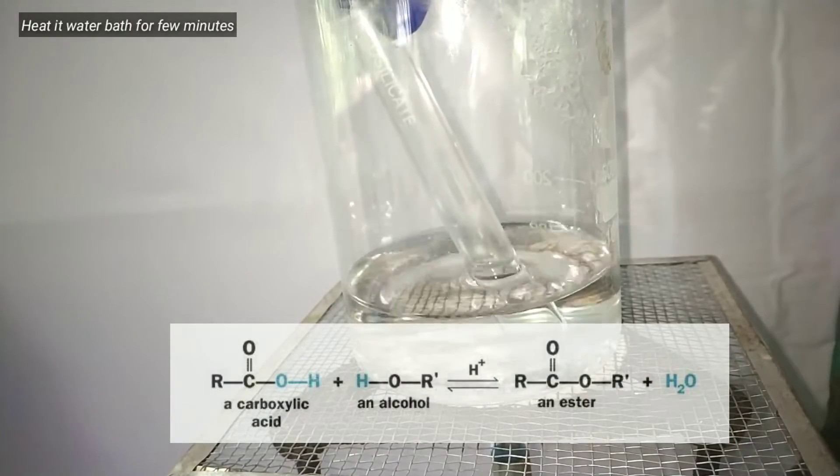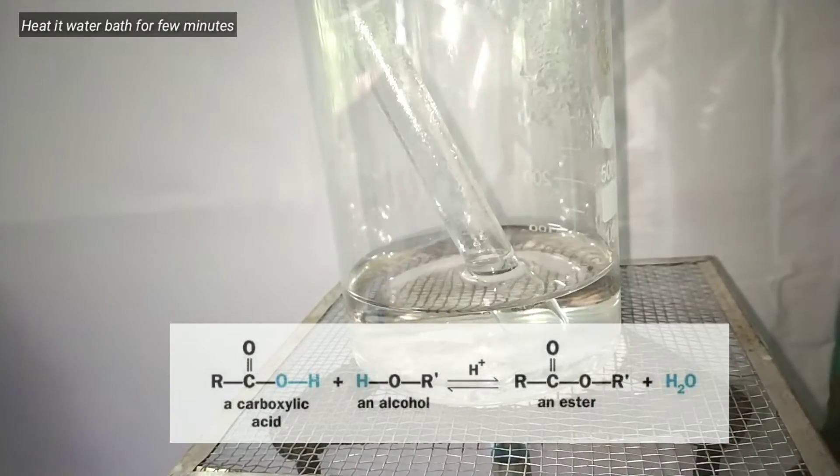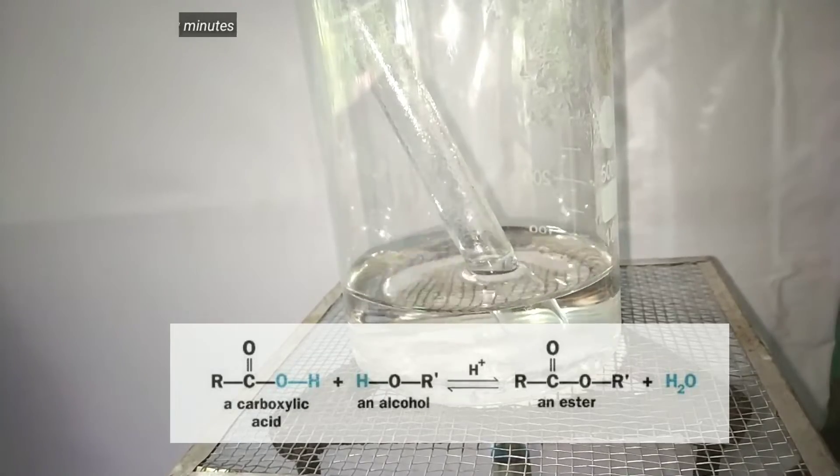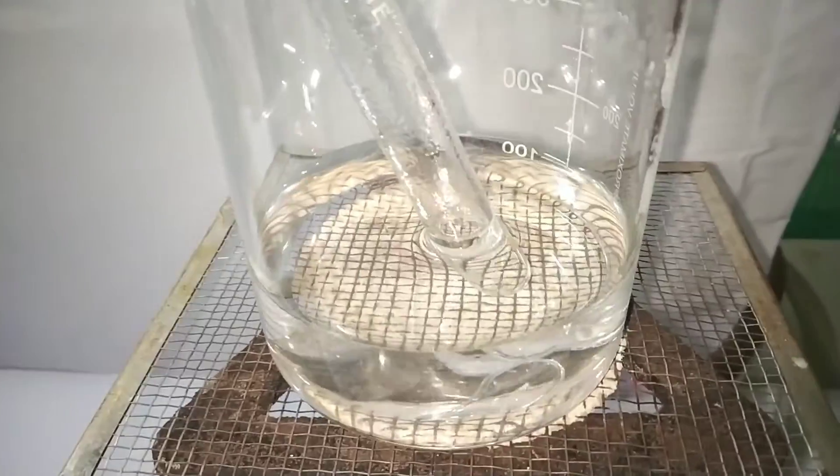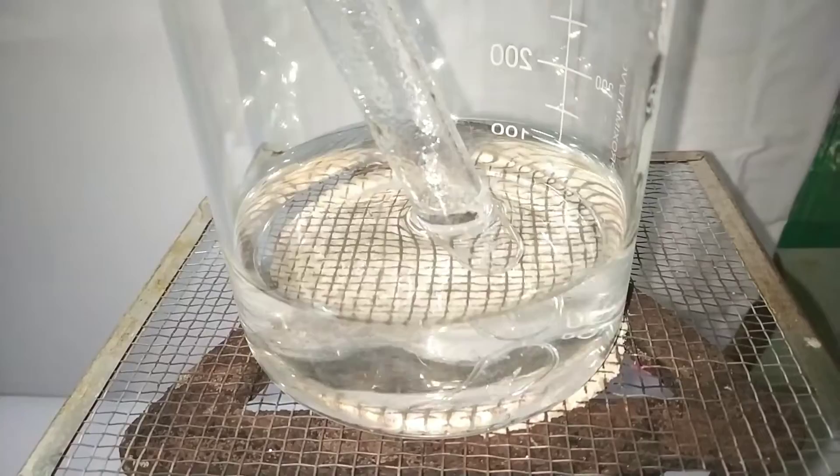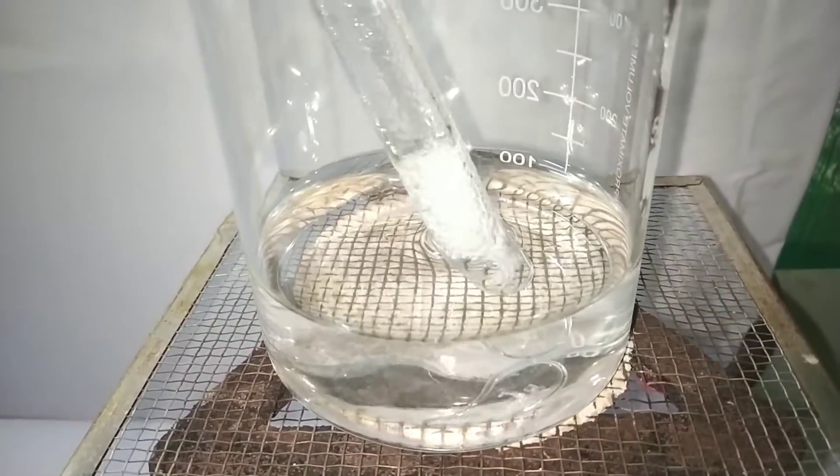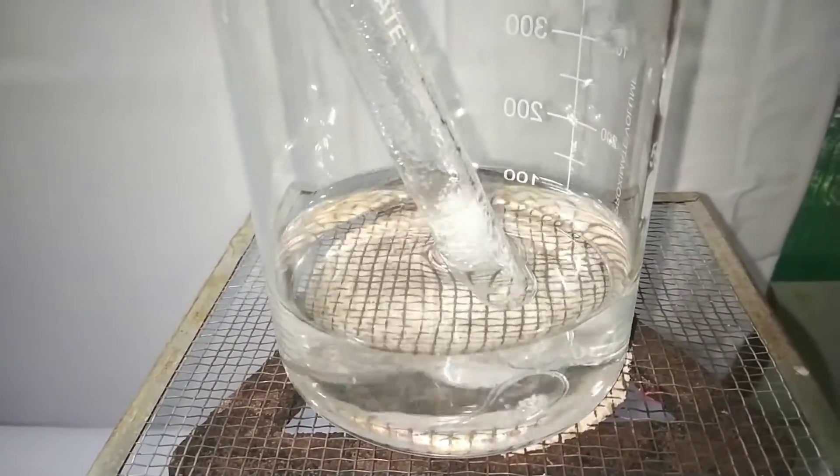Now we place the test tube in a hot water bath for a few minutes. What's happening here is carboxylic acid reacts with alcohol in acidic medium to produce fruity-smelling compounds called esters.